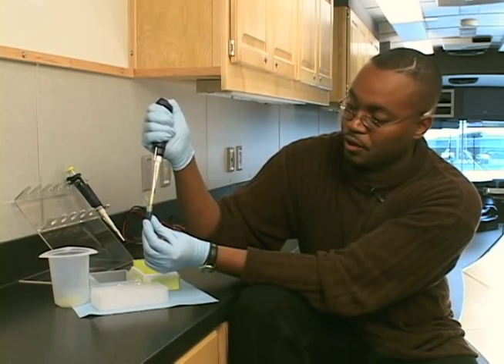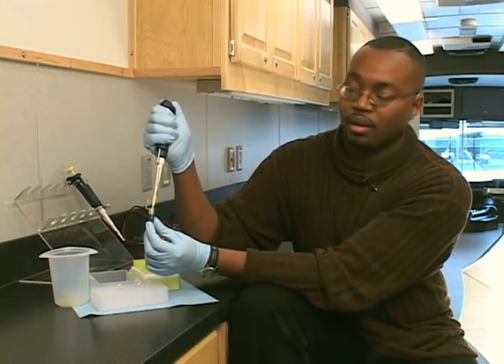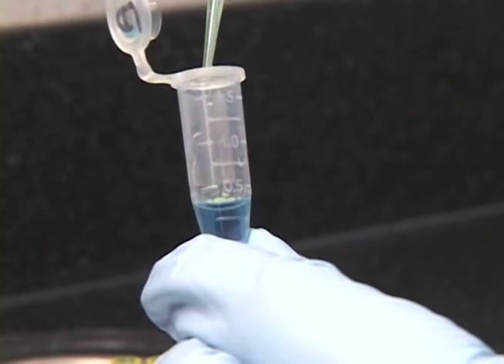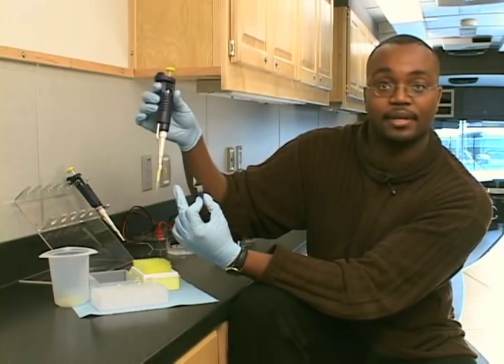It's important to put it under the surface because if you don't, then you may also draw up air bubbles. I'm going to gradually release my thumb, and that's going to cause suction to occur and draw up 20 microliters. That suction holds that liquid in the pipette tip.